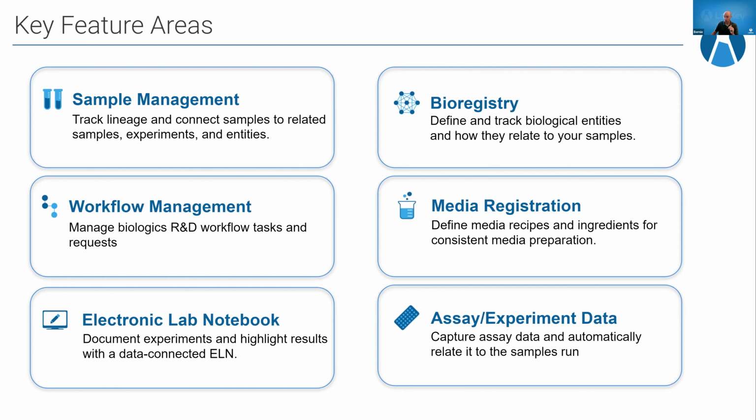So what I would recommend, and I could jump all the way back to that growth slide that I talked about, is we will help scale with you in terms of number of users, in terms of functionality. One of the things that I think is most important about our product suite is the way that they grow into each other.